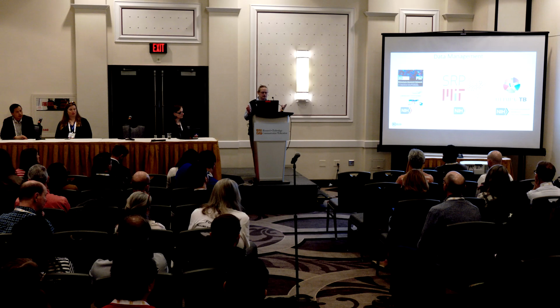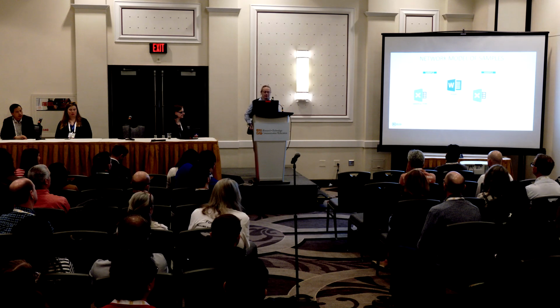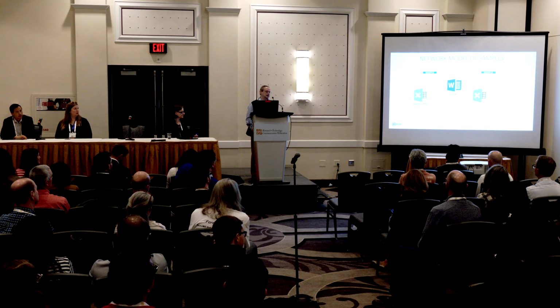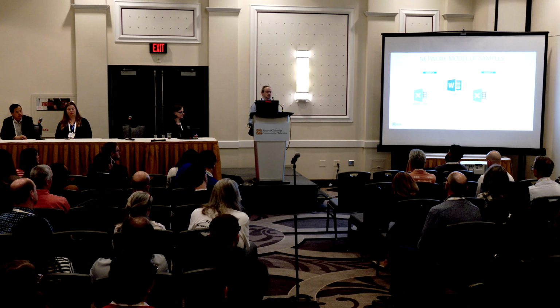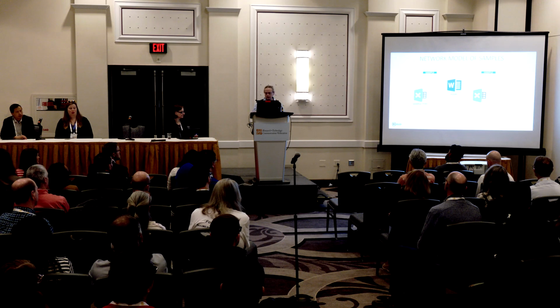And we needed one system to rule them all, because I wasn't doing it 4 times. So we found a system called CIPP, and that's fundamentally what we've used. We've built a wraparound, but the core of CIPP is it's incredibly reductionist. It has this idea that your samples are nodes, and they're described by tables. And your experiments are edges between those nodes and making a graph, and they're described by protocols, which are Word docs effectively. And from this, we can build networks.